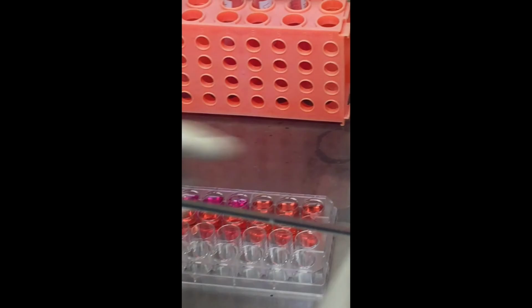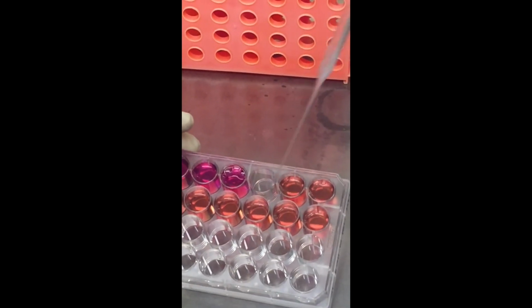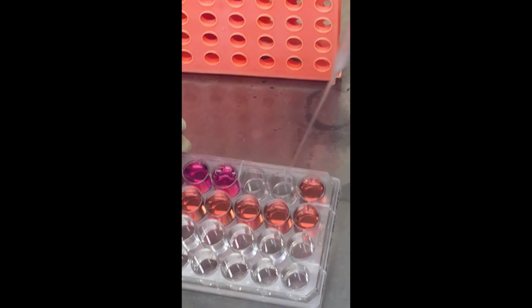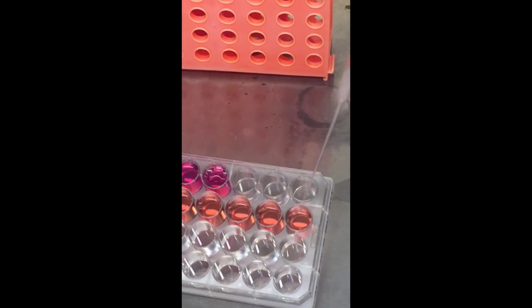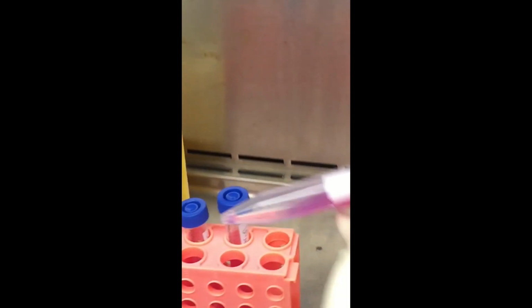Oh, sorry, I already have one. For all your treatment groups, remember your drug is in there, so make sure to invert and make sure the drug is equally mixed before you put it in.